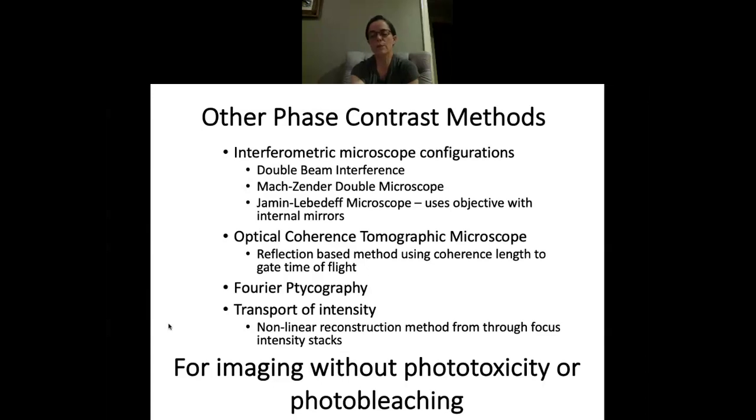The advantage of transmitted light in quantitative phase microscopy lies primarily in the low number of photons needed to acquire high contrast, and the correspondingly low phototoxicity in the sample environment, such that time-lapse microscopy can capture dynamics of biological systems over long time scales.